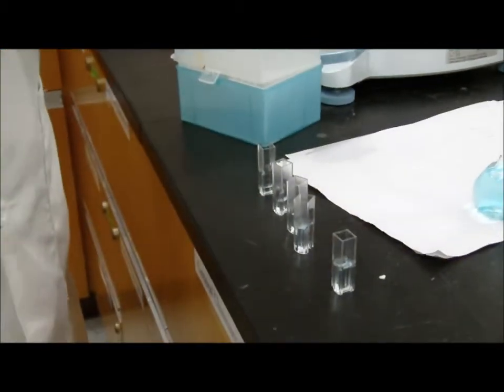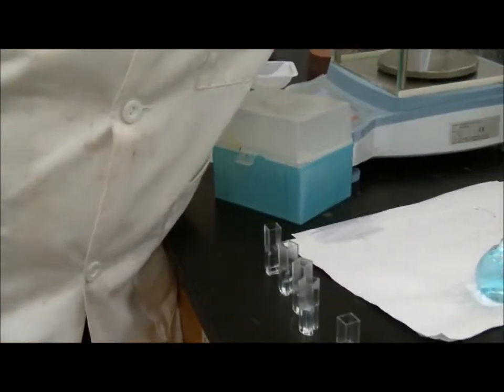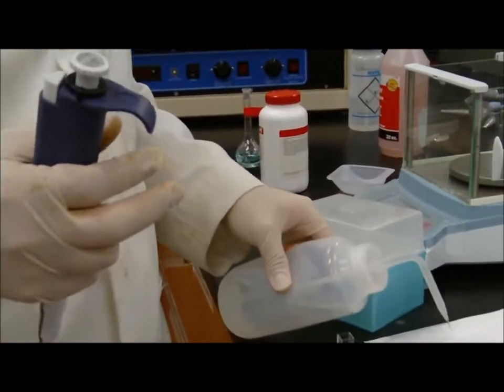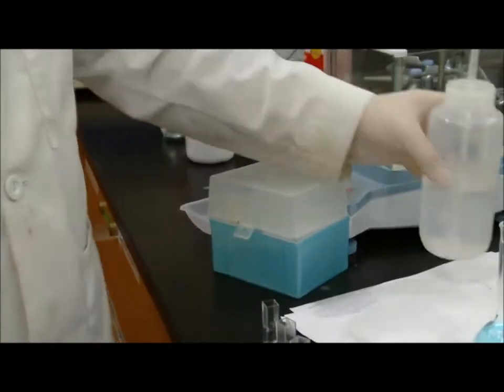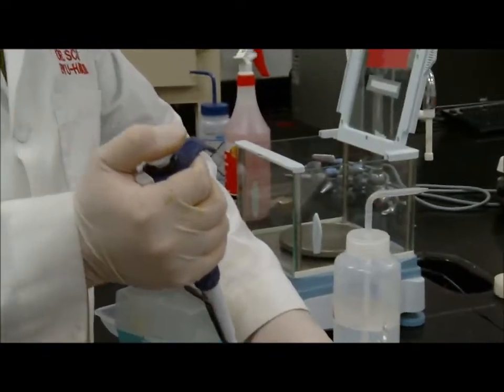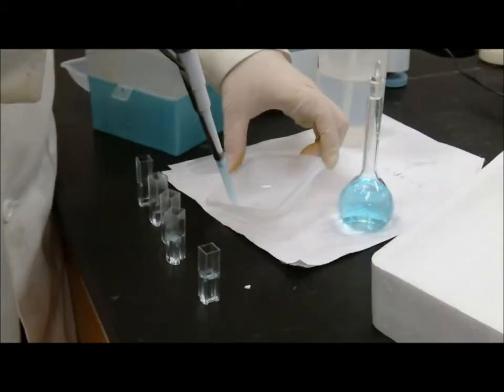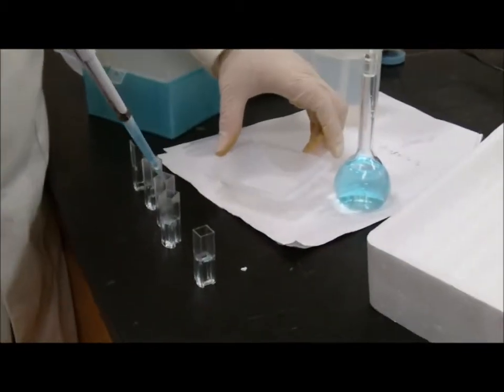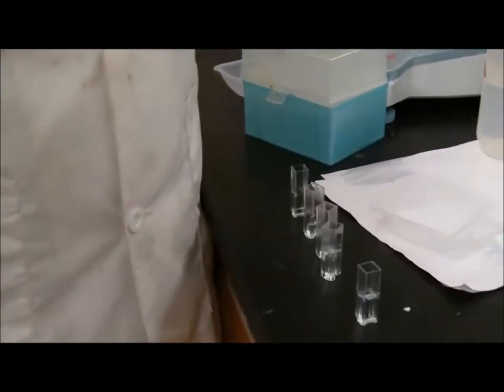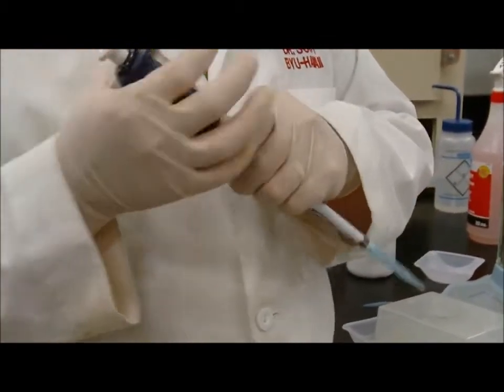Okay. Now I change my tip. This pan here will be my water. I'm at my 0.2, so I'll add my 0.2. This is my 20, 40, 60, 80, and my 100%. So I have my 0.2 to my 80%. Fill it up to 1 milliliter. And then for my 60%, I need to add 0.4 milliliters of water.